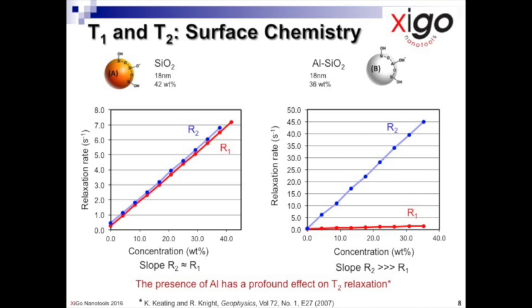Silicas are used extensively in a wide variety of applications, and it is well recognized that they can contain iron, Fe, and aluminum, Al, as impurities. The example given here demonstrates that NMR can readily reveal the presence of such impurities.